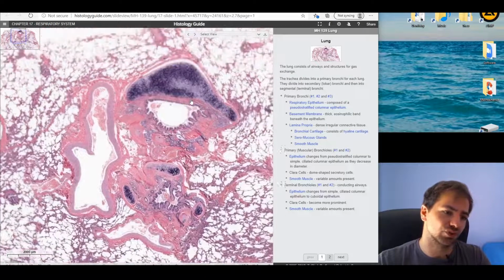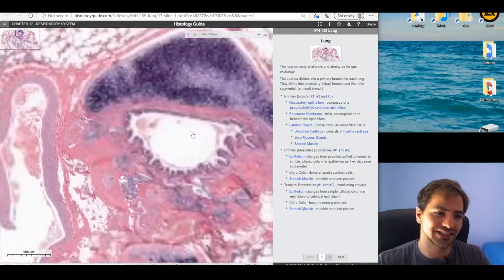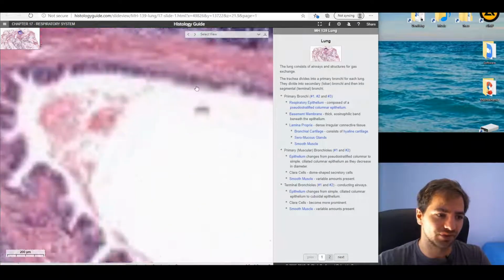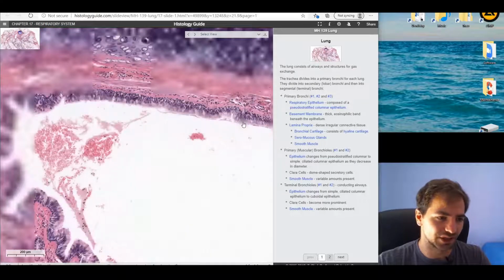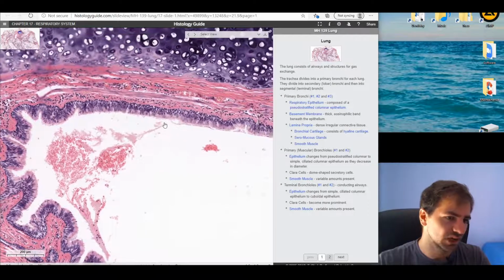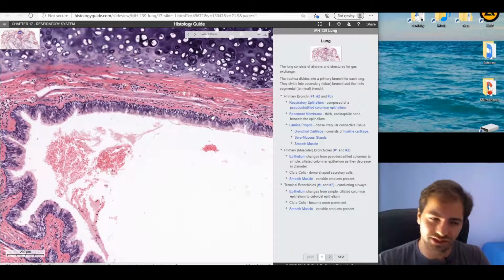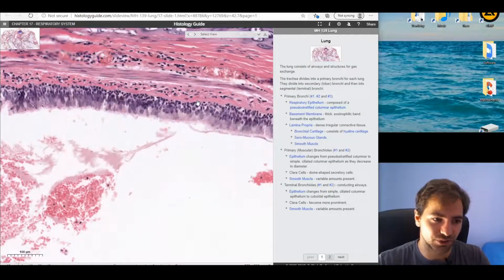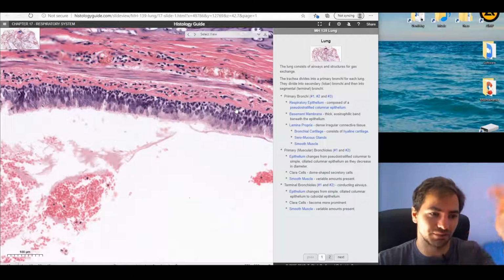This is a bronchus. So if we zoom in, we're going to find exactly the features that we discussed. First we find the respiratory epithelium exactly right here, the typical ciliated structure, along with the lines of the mucous membranes. Exactly beneath, we find the typical structure of the basal membrane, the very thick basal membrane, as you can easily see, exactly beneath the basal cells.